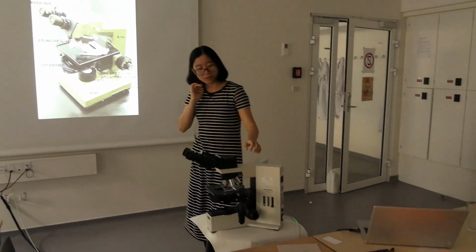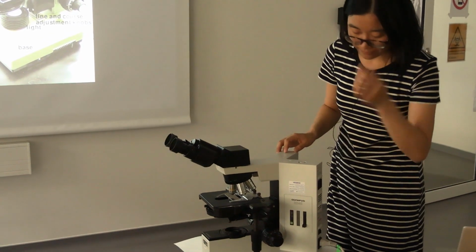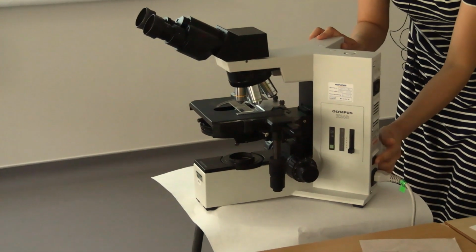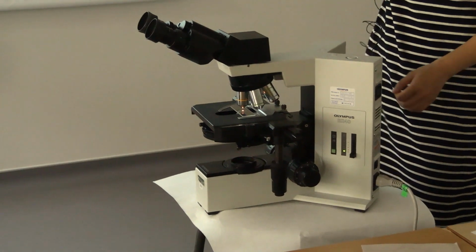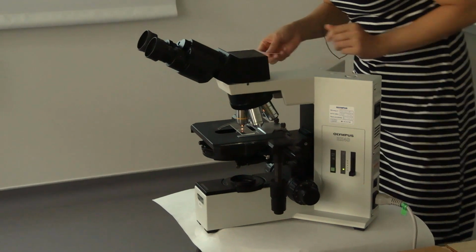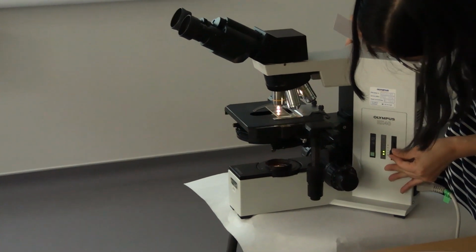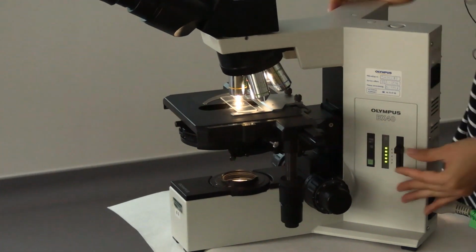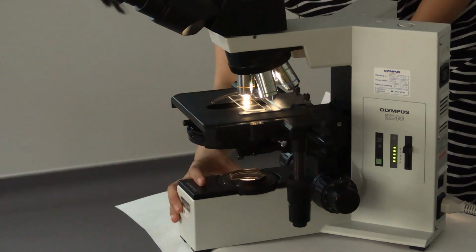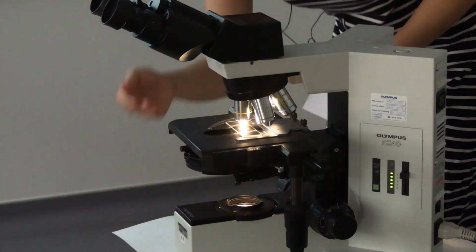So here I will show you the real microscope we have. First we need to switch on the button here. We need to switch on this microscope. And I will show you the light. If we just switch a bit. So here shows you where the light comes from. This is the light source. And you turn a little bit here, you can see there's a strong light here.